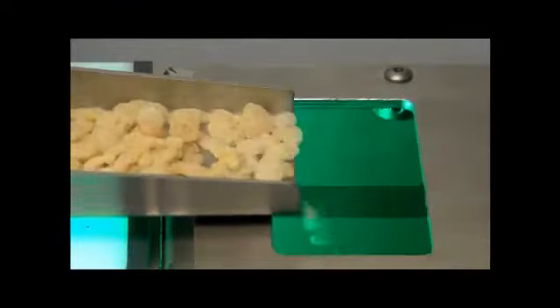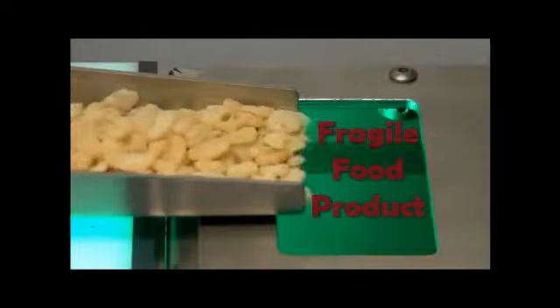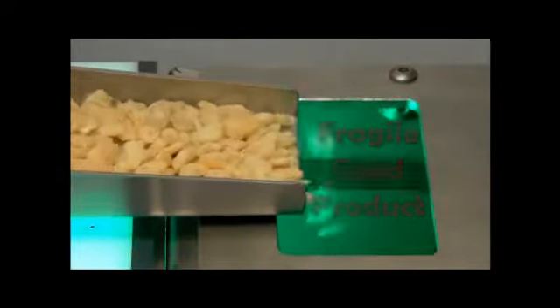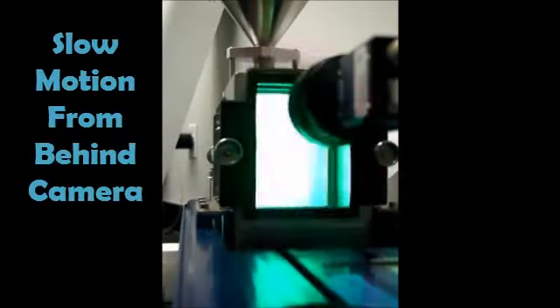And finally, a very fragile sample which wouldn't be broken or deformed by this type of analyzer. And this is the slow motion view of the tumbling particles taken from behind the analyzer's optics and digital camera.